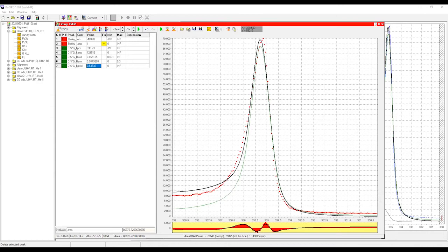Pressure inside the NAP cell would go maybe maximum to 10 to the minus 7 millibar. And this is already quite poor vacuum for such sensitive samples as palladium. So in several minutes, you would have at least 1-2 monolayers of something on the surface. So how do you clean the analysis chamber? Do you maybe purge with argon or with some gas?